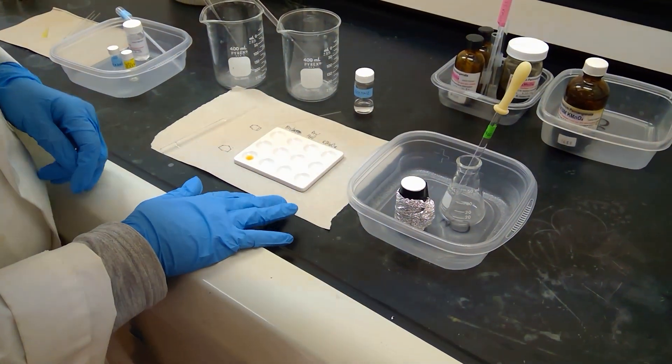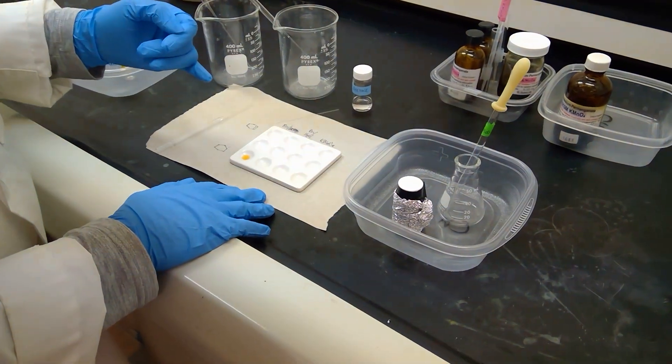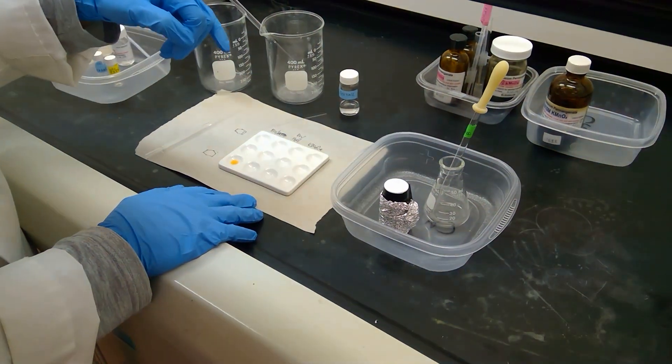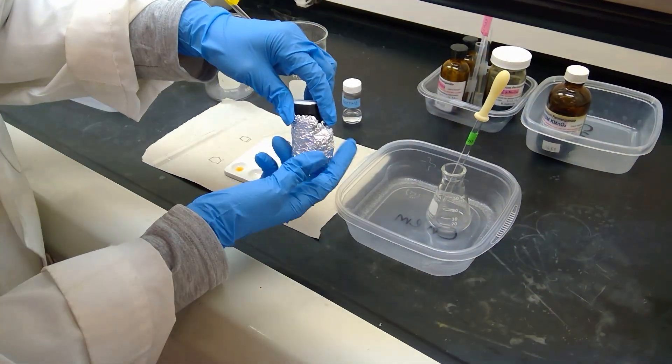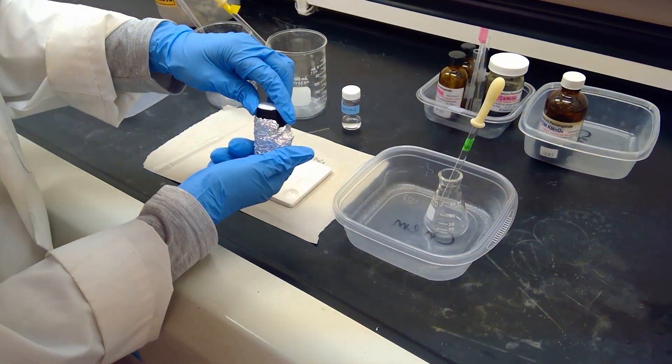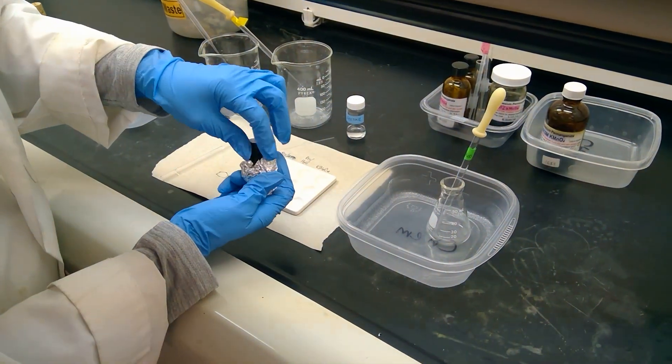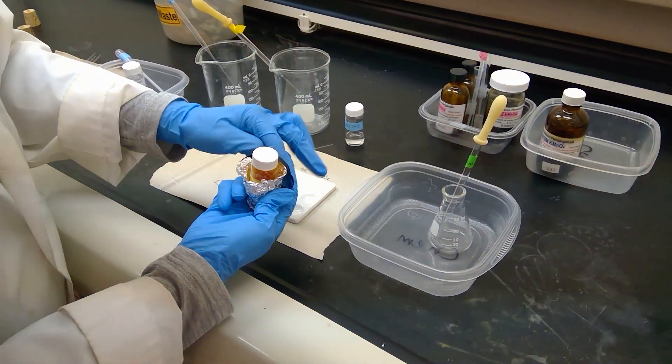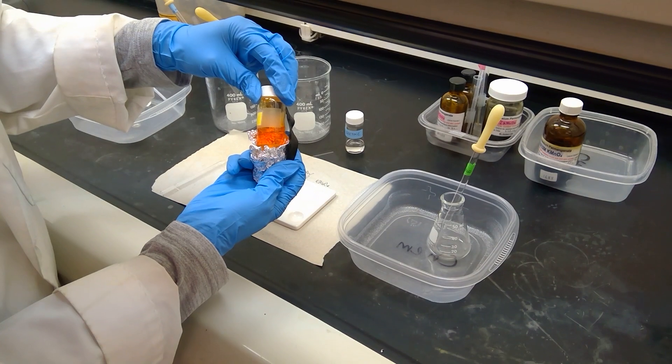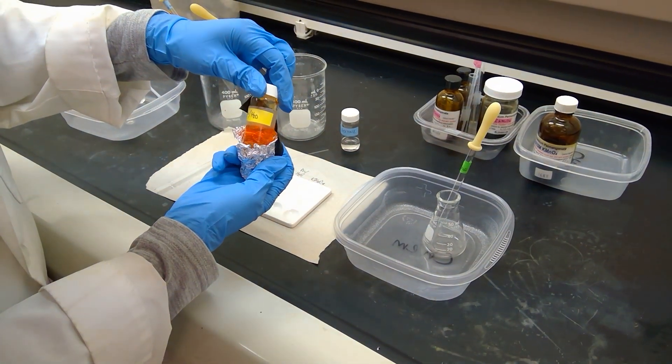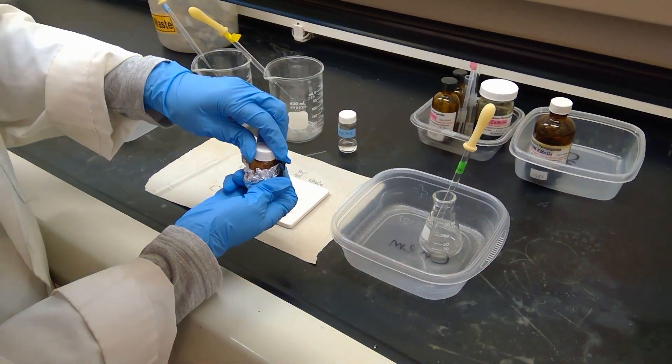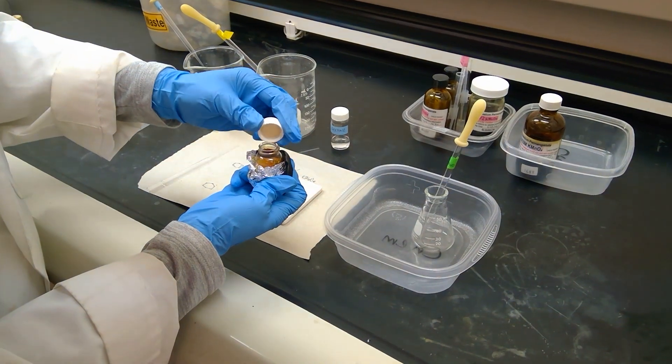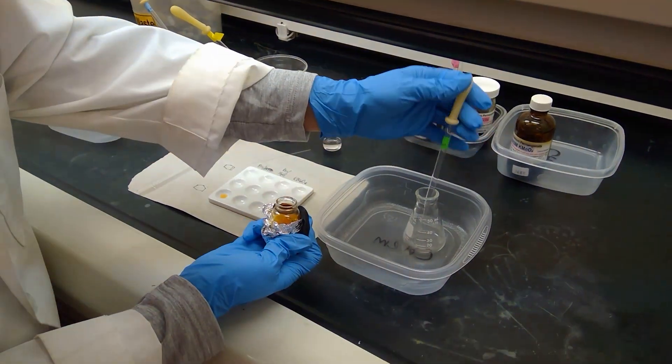Next up, we're going to test our same two compounds, cyclohexene and cyclohexane. But this time, I'm going to use an aqueous solution of bromine. I have it here covered with foil because it is light sensitive. It is an orange solution dissolved with some water. I'm going to add five drops to each of my wells here.